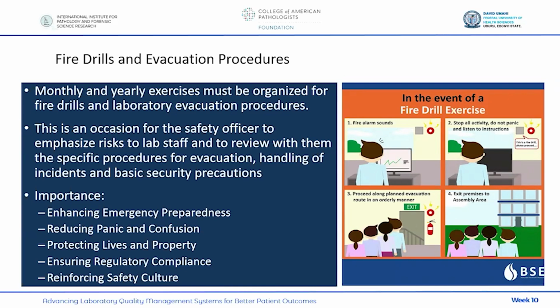So it enhances emergency preparedness because you're not going to wait until something happens, then everybody's running helter-skelter before you're now shouting instructions to people. People may not even be in the state of mind to hear you. So it's always better for you to prepare everybody in the lab in case of any fire. This fire alarm might sound. If you don't have a fire alarm, you'll have a whistle. Improvise with a whistle, improvise with anything. Once you hear that, drop everything you're doing, stop every activity, don't panic, move towards the exit routes. Everybody should know about the exit routes in the laboratory.